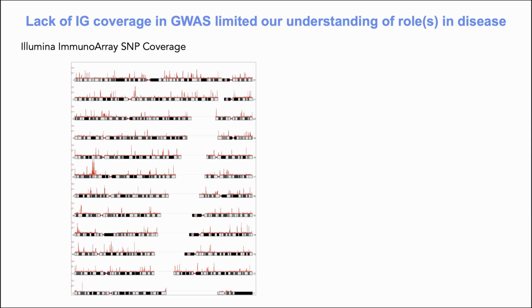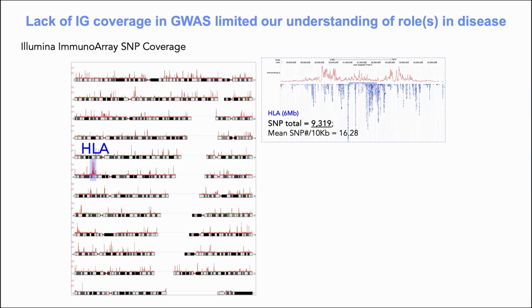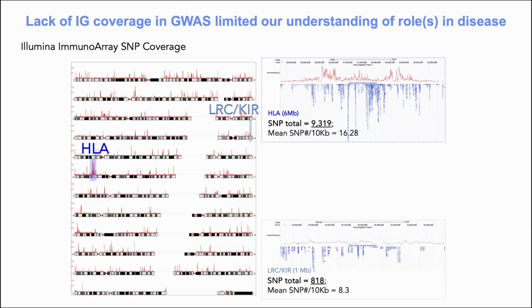Well, for many, many years, we were doing disease association studies using array-based technology, or GWAS. What I'm showing you here is a density map of the oligoprobes across the entire human genome. When you look specifically at the variants that are represented in this array in immunogenomic loci, or those genes that encode our immune system genes, you see that there are genes that we know are really associated with disease, like HLA. Some consider this the most polymorphic region of the human genome. Even less well-characterized regions, like the KIR receptors that are involved in NK cell action, are reasonably well covered with hundreds of variants reflected.